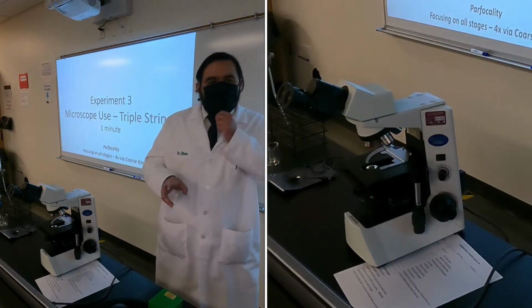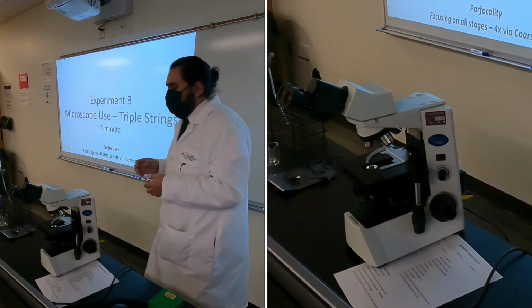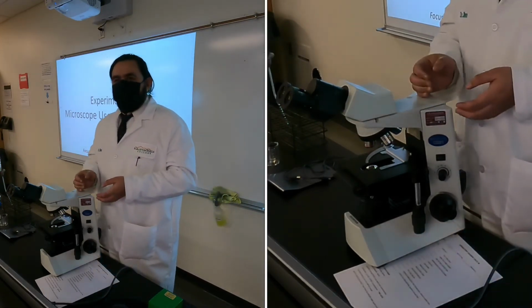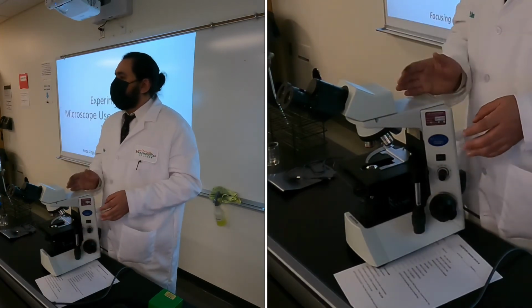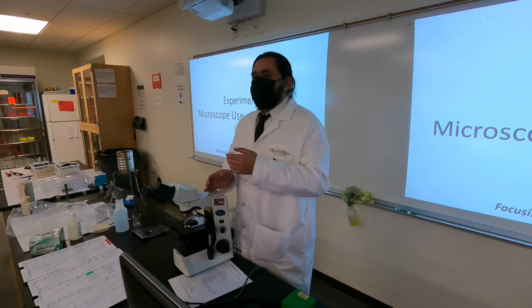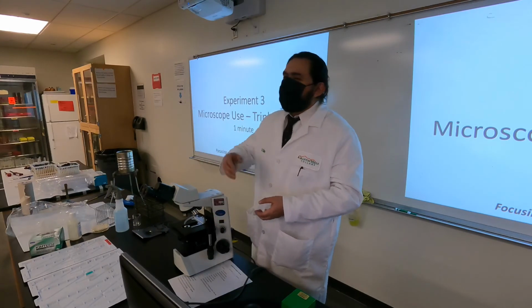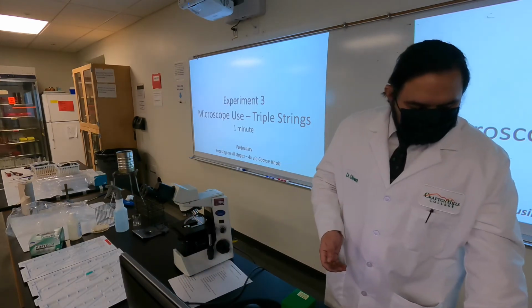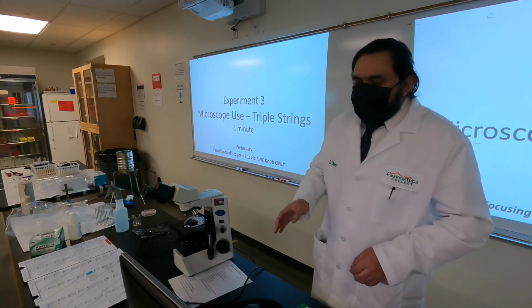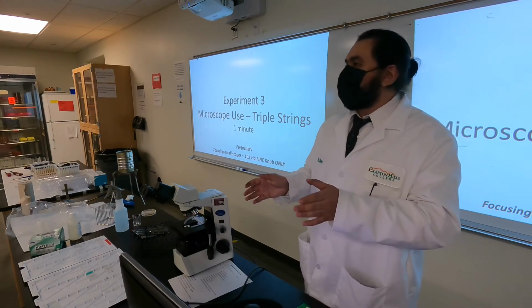Two things are gonna happen. You're probably gonna need to add a little bit more light because it's starting to get darker as you're zooming in. And you may need to recenter it. So use your X, Y, and stage adjusters to center the image. And again, take a pretty picture, show me, or it didn't happen. All right, and then we're gonna decide one more time which string is on top, which string is on the bottom. Okay, so we've gone from the red to the yellow, so from the 4X to the 10X, right?